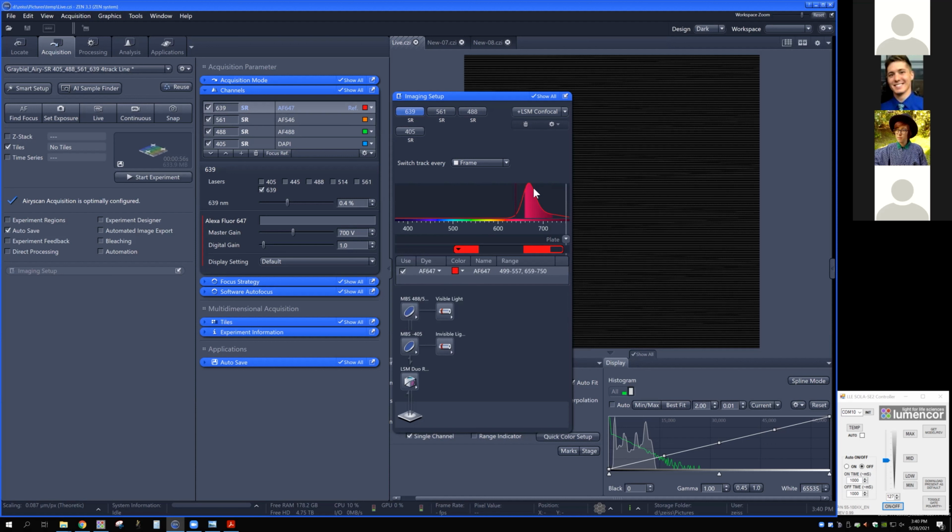So again, this is going to give me just this range. We don't expect any signal back here. We don't get backwards fluorescence or higher energy photons. So that should be good. And this range is nice and trim as well. This range should be nice and trim as well. Does that make sense?